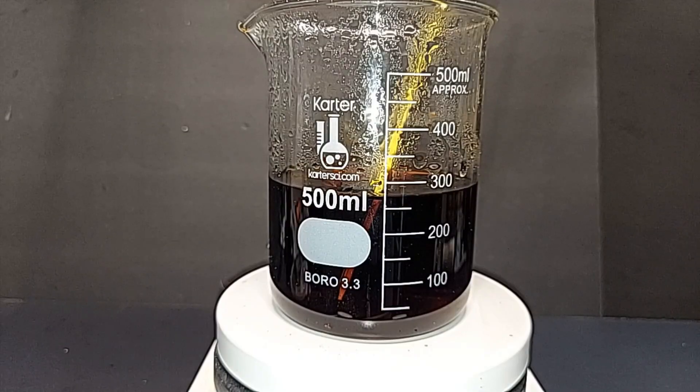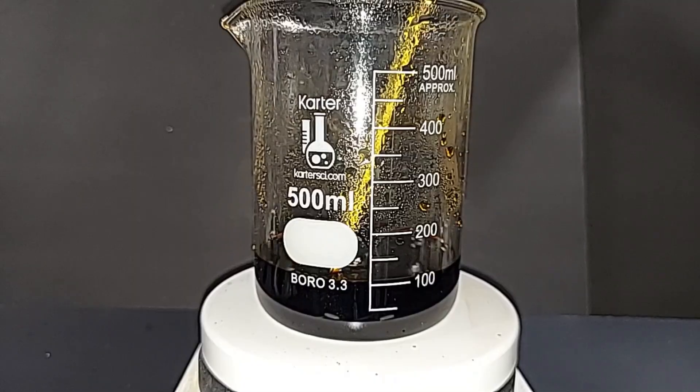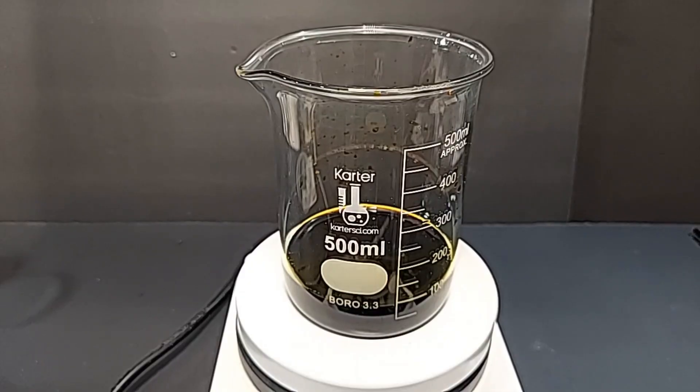I started a time-lapse but after half an hour only about 25 milliliters had evaporated, so I'll just check periodically. After one hour we're at 200 milliliters, temperature holding around 92–95°C. After another hour there's about 100 milliliters left and the temperature has risen a few degrees because there's less liquid to heat.